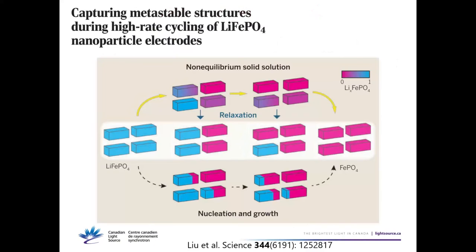And they explained that this gradual transition is more convenient for the lifetime of the battery as opposed to separate phases, either one or the other.